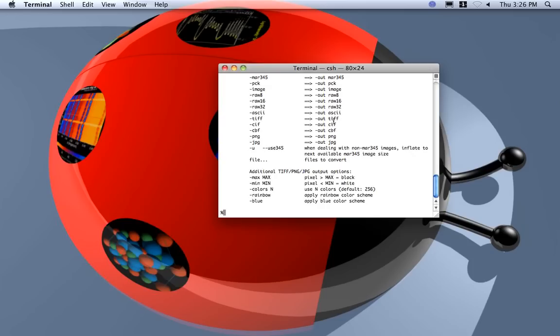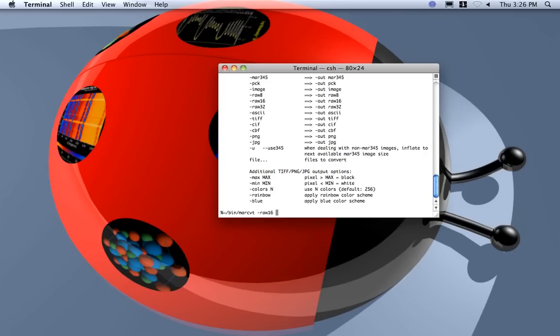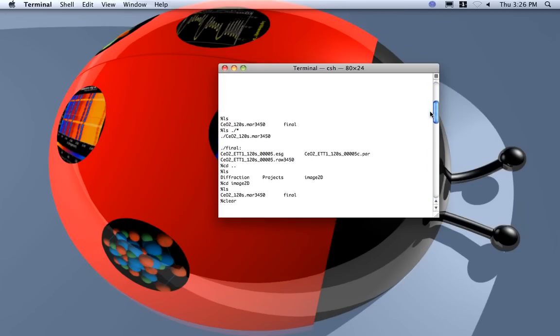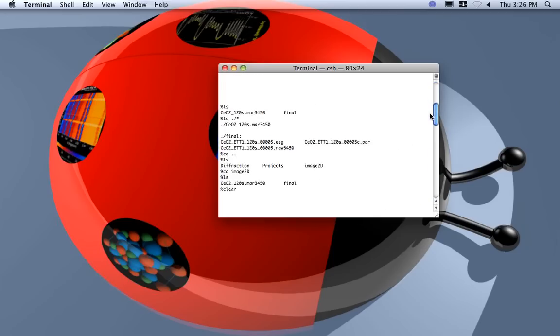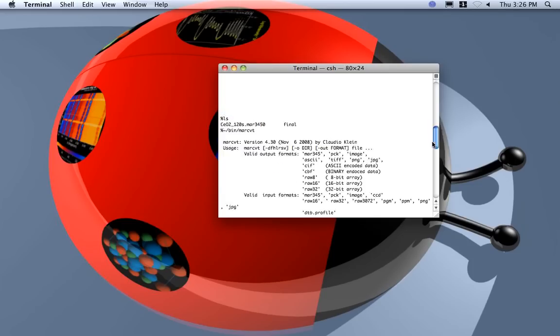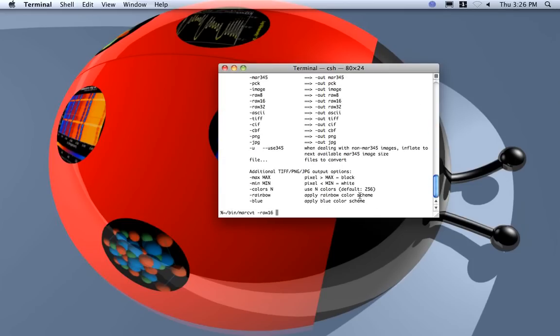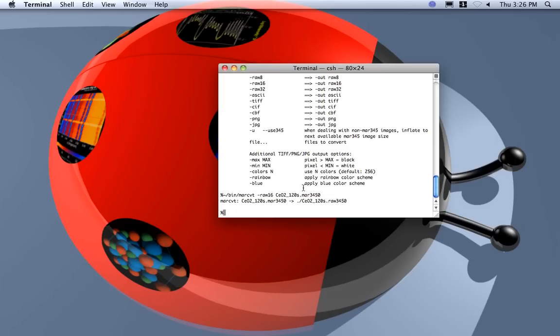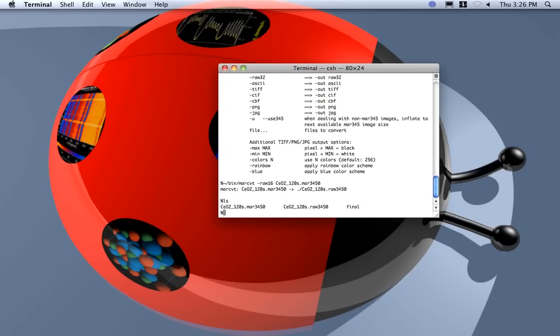So I will convert instead in raw 16, so 16-bit. So let's do it. I do MAR cvt then minus raw 16 and the name of the image that was actually okay here. I copy and paste, okay. And done, okay if we look actually it is done.